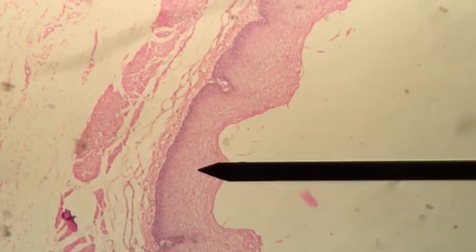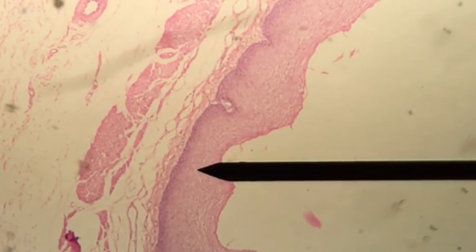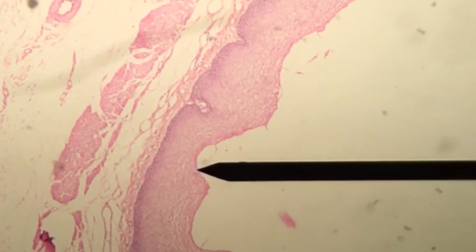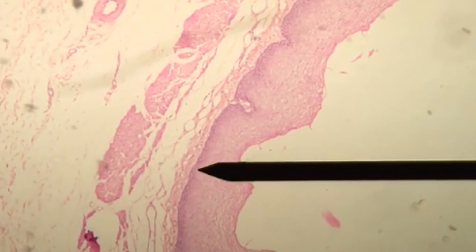We're going to focus on our first layer. This is the mucosa. It is characterized by stratified squamous epithelium. You can see the pointer pointing to all those stratified cells.